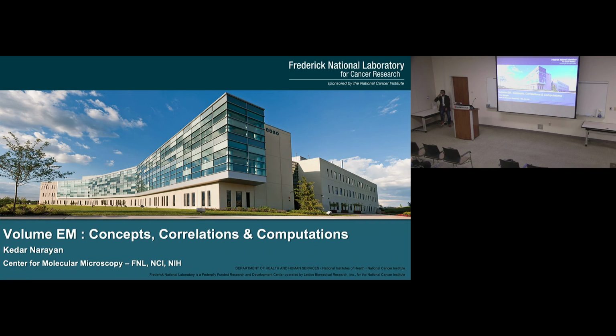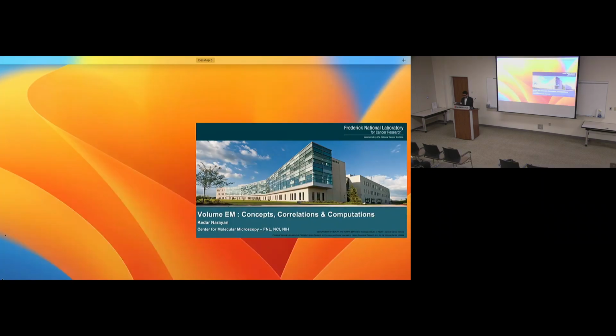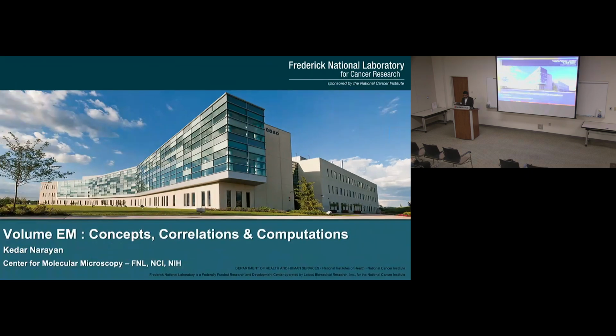He and his group have done some AI applications to segmentation that the core is interested in. As you probably know, we have a serial block-face SEM which sections quite a bit of data. One of the bottlenecks of that is doing the segmentation. So our hope is that over the next year, we can improve our segmentation capabilities significantly. So welcome, Kedar.